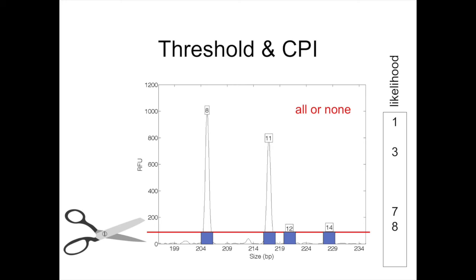What CPI did is it took it one step further and said that for genotypes, there would be no weight of different probabilities. Every possibility that was on a pair would have the same weight. So it would be all or none. Either an allele pair genotype was present or it was absent. And the result was a tremendous loss of information, a lot of error.